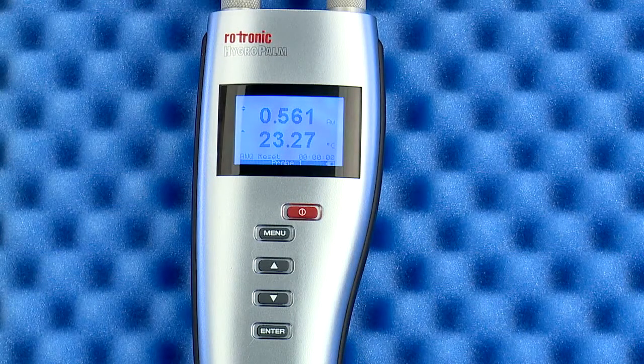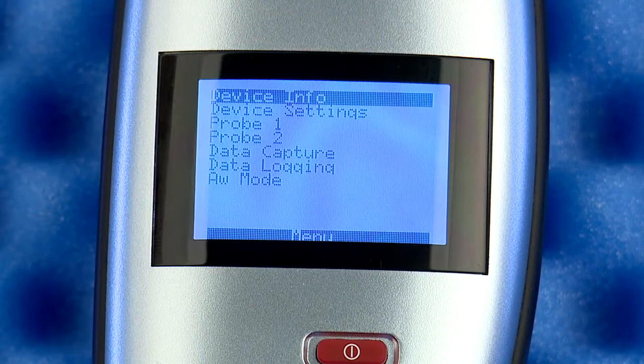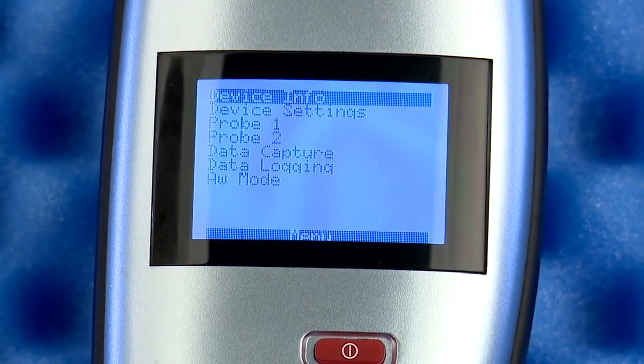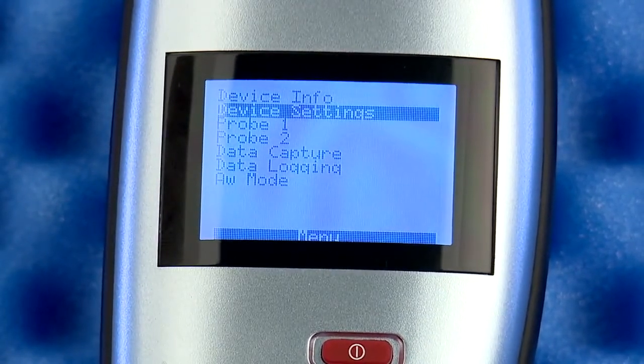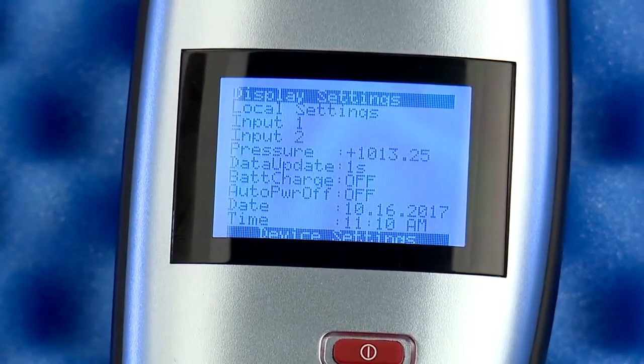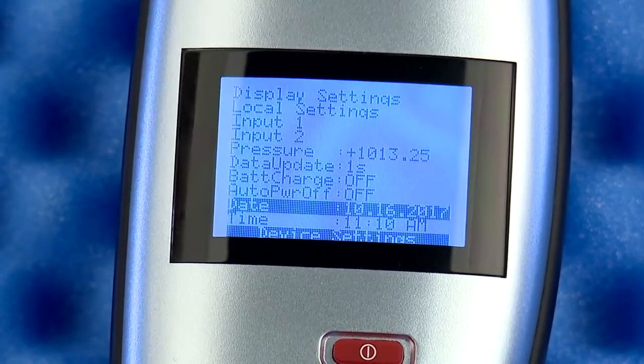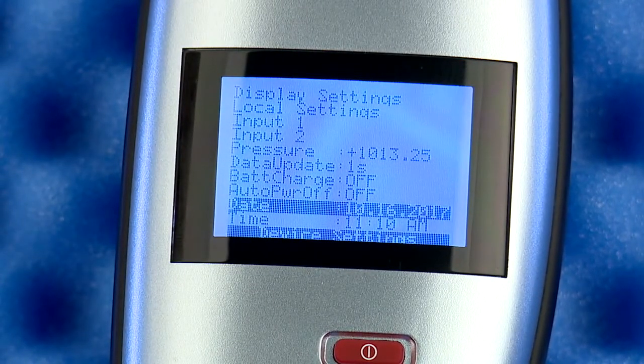When you first get your HP23AW, it is a good idea to get familiar with the menu structure of the unit. Let's start by pressing the menu button. There are many accessible settings in the seven menu choices, but for this video I will review just two important sections. Under device settings, check the date and time — you can scroll down to them and change to your local settings. The date and time are used when storing the AW readings locally in the instrument.